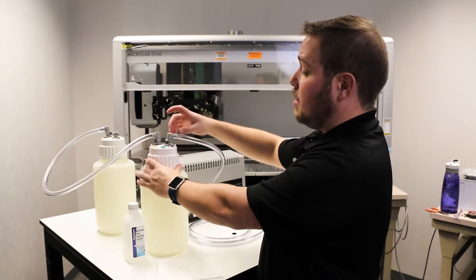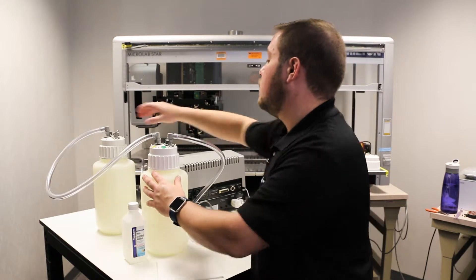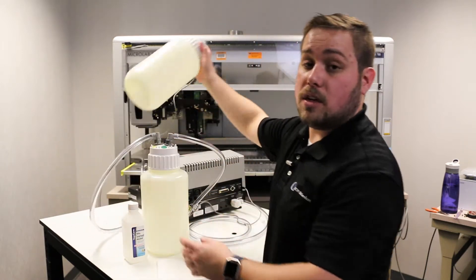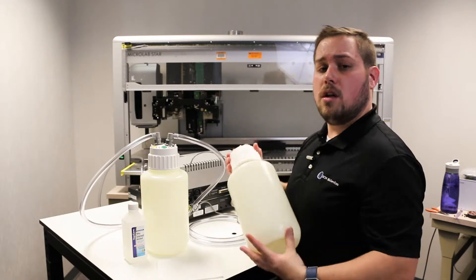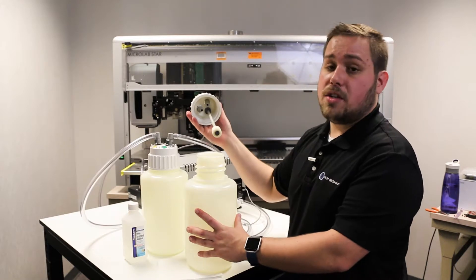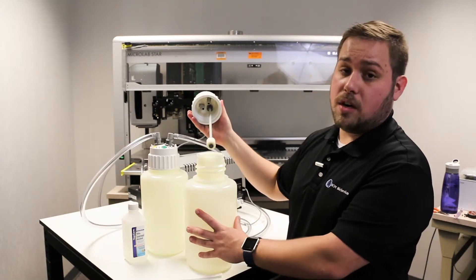Make sure that all tubing is properly threaded on the fittings. On the secondary waste container, we have a float sensor that detects if there is too much waste coming through. It helps to protect and prolong the life of your vacuum pump. You'll want to make sure that it's clean, clear, and functioning correctly.